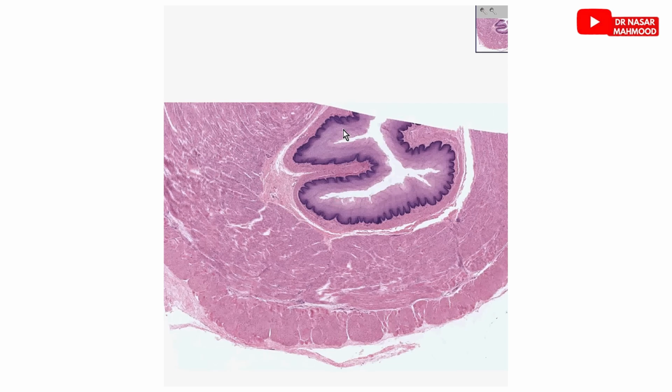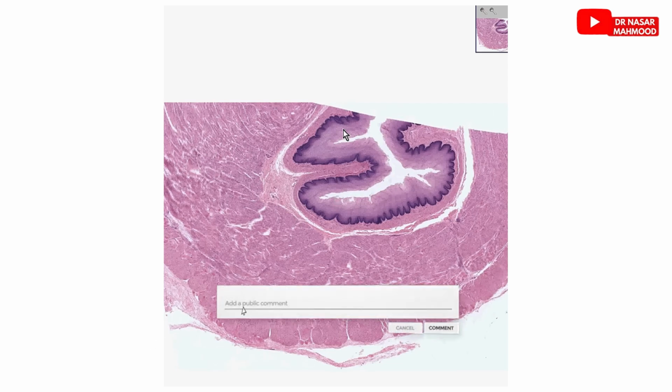And that's it, guys. That's the classic histological structure of the esophagus, a muscular tube designed to move food efficiently from the mouth to the stomach.